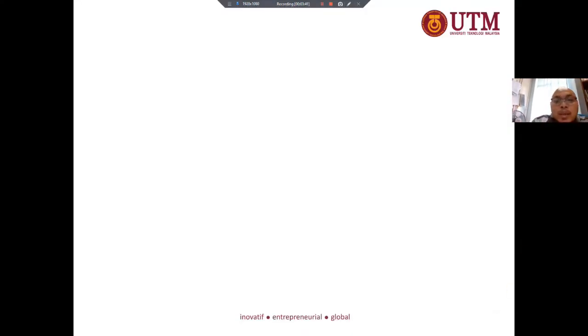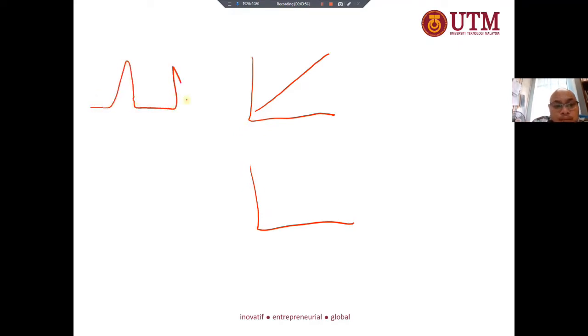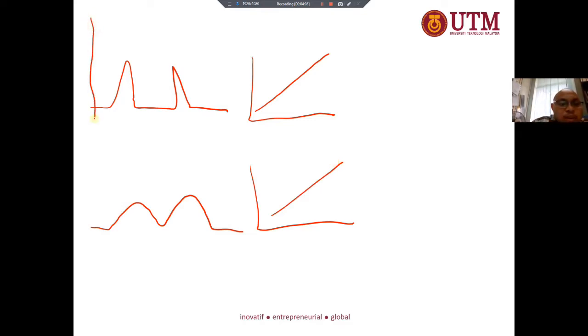Okay, can you imagine when you want to perform a calibration curve? Let's say you have one with a very good sharp peak and one where you obtain a very broad peak. For example, if you look over here, the intensity of the sharp peak may be 10, but the intensity here may be 4, even though the concentration of the analyte is similar in both chromatograms.